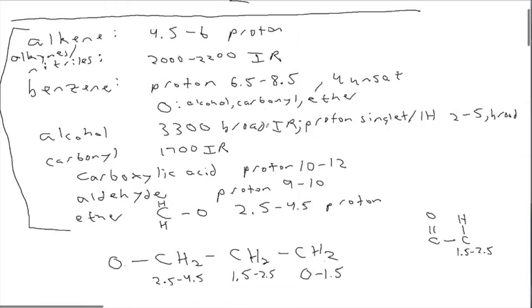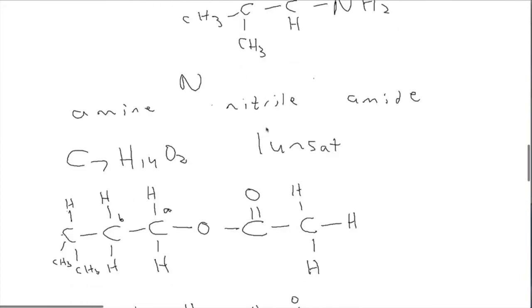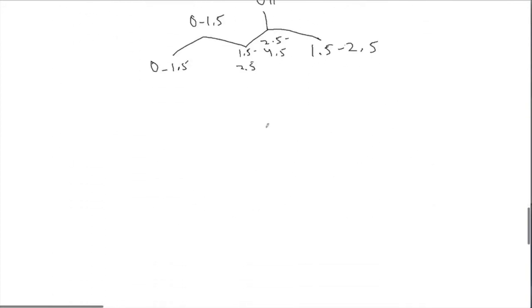So how would we do this structure here? You guys came up with the right answer. You might have overcomplicated it a little bit. So when there's an alkene, start by focusing your picture on the alkene, like this. Now, some of these are carbons and some are hydrogens. How many of these attachments are hydrogens? 3. That's obvious, right? That's obvious from our proton NMR spectrum.